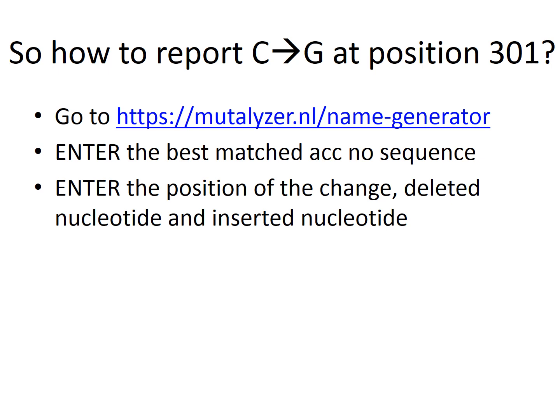To see the scientific name of the change or mutation in the new sequence, you can go to this software, Mutalyzer, and it will generate for you the name for the change of your new sequence.